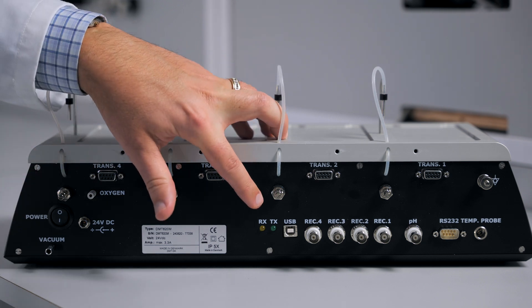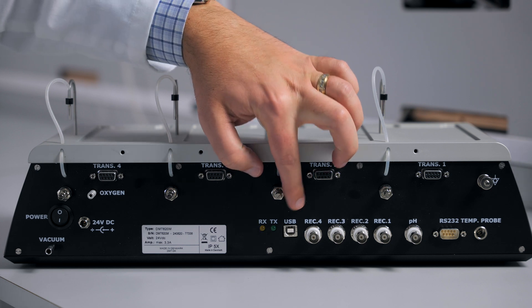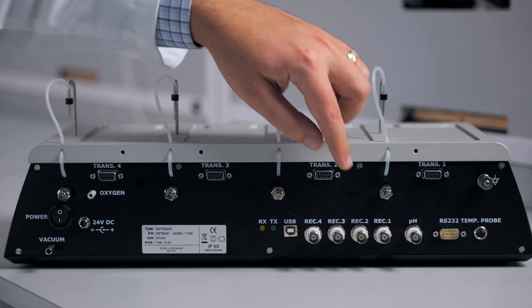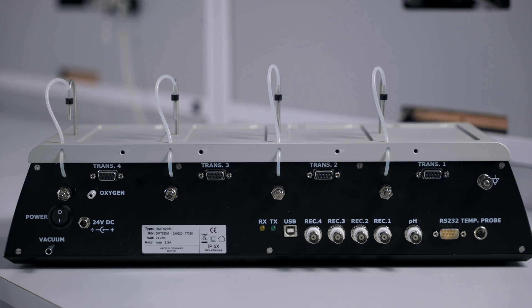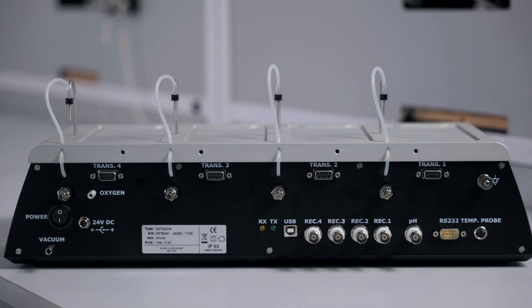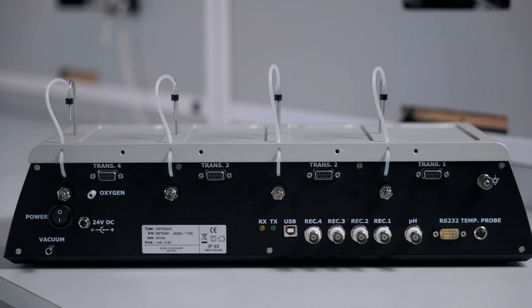The RX and TX lights will show data communication. You have a port for a USB cable, which will allow you to send your data to a data acquisition software. Or you could use the four BNC outputs to send your data to an analog-to-digital converter. There is a connection for an optional pH probe. There is a connection for an RS-232, but this will only be used for factory diagnostic testing.